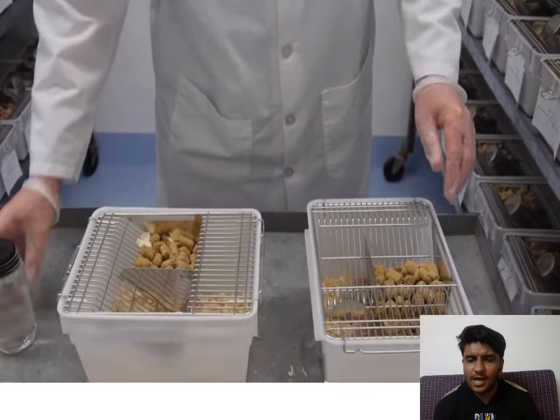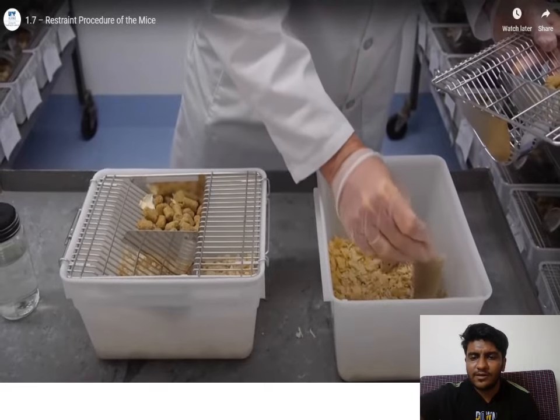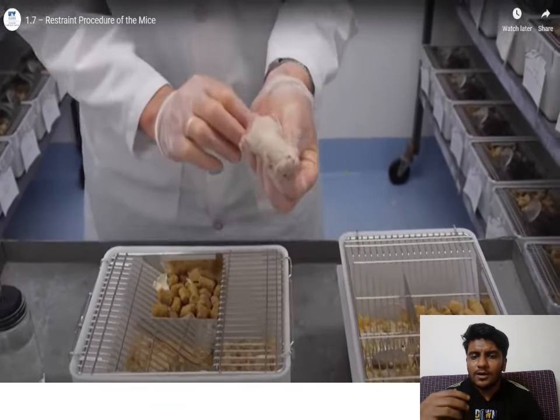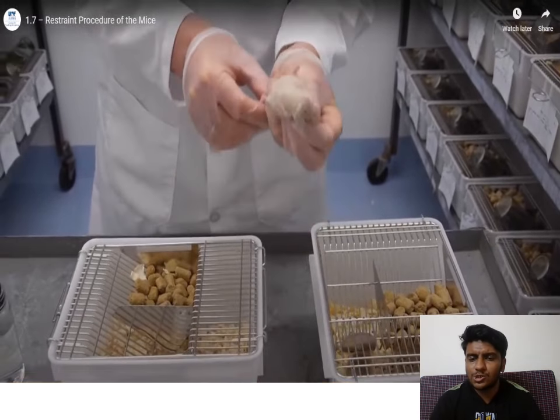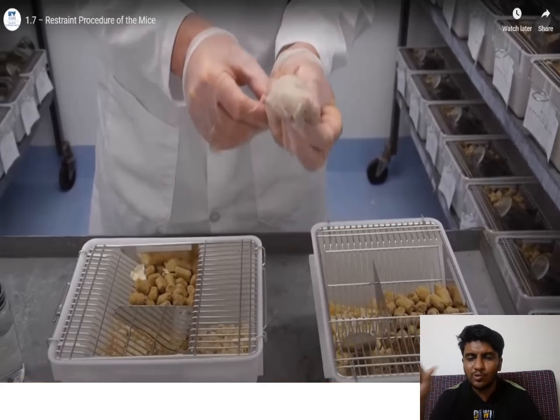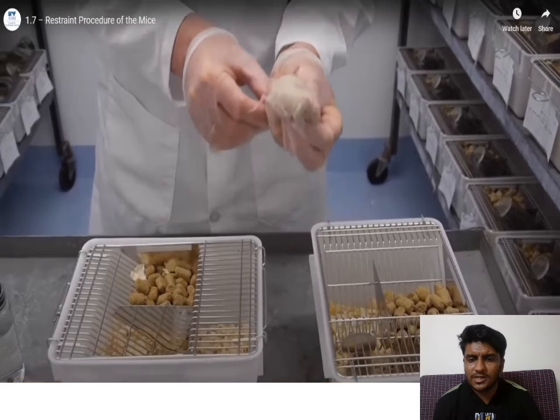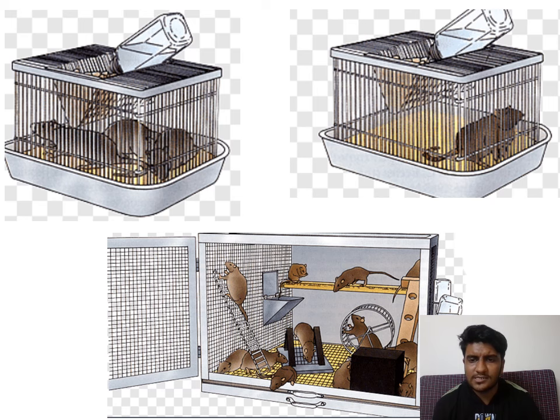This video shows how to scruff a rat or mouse. Place the animal on the cage, then carefully remove it without mishandling. After keeping it on the cage for some time, scruff it — catch the loose skin near the ears. There are C and V methods. Turn the animal upside down using your thumb, index finger, and ring finger — keep the tail between the ring finger, and use index finger and thumb for scruffing.